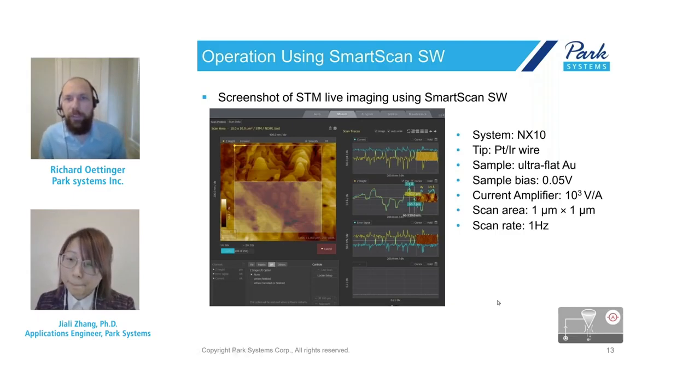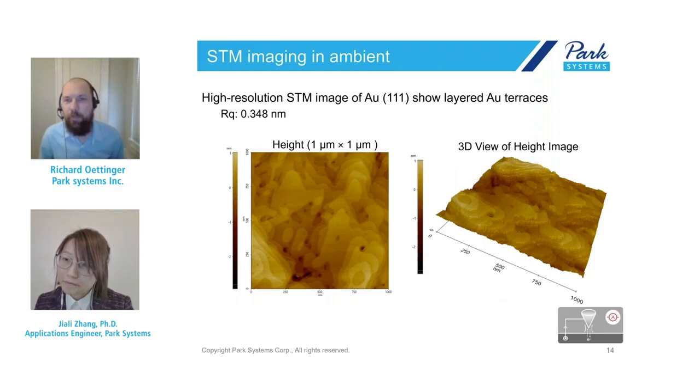All right, here's another one. With regard to the question of quantifying the radius of the tip, I understand that at the beginning I can get it from the information provided by the software or the information from the tip that I buy. But if it wears out in the process, how can I quantify it?